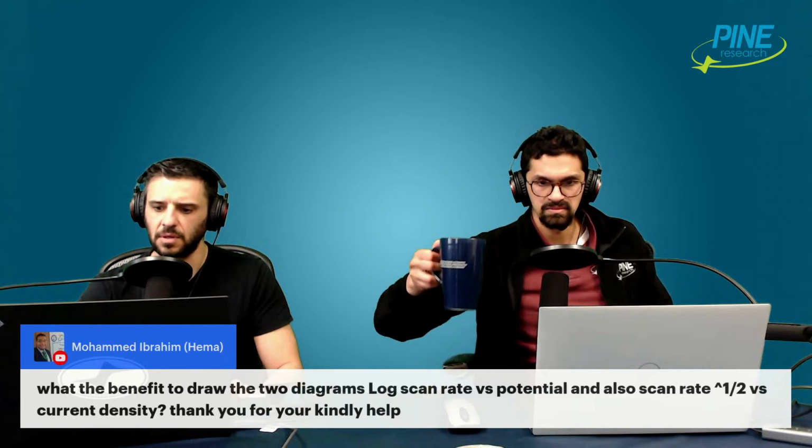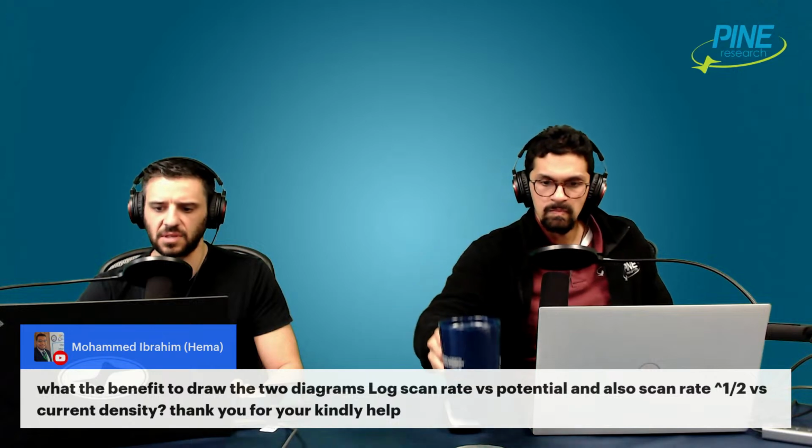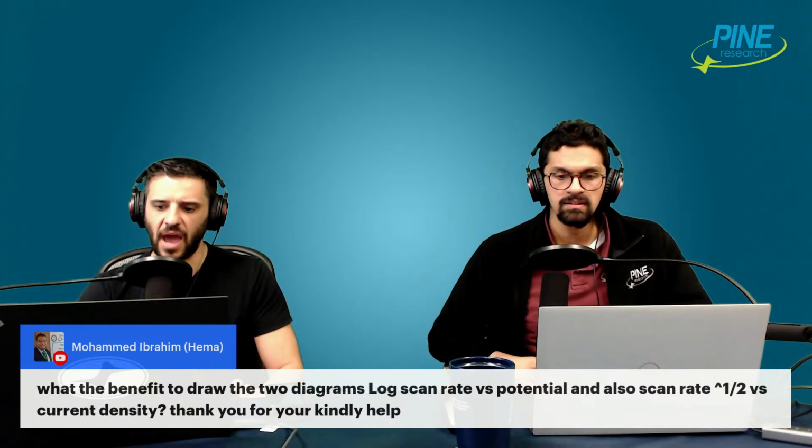Okay. Do we have any more new questions? There's one question about a couple of different plots that can be made. I can talk about that. So Mohammed had asked, what is the benefit to draw the two diagrams, log of scan rate versus potential, and also scan rate to the 1/2 versus current density?